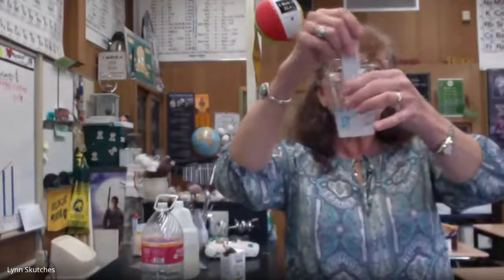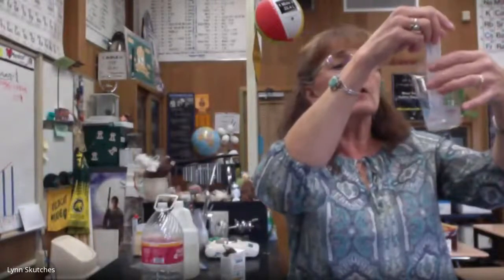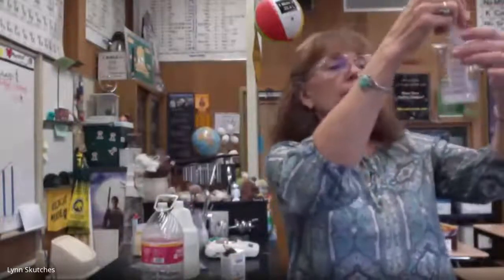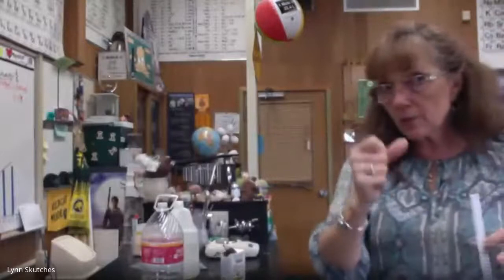Notice what's happening. See what happens to the temperature. Does the temperature change when you put the salt in the water? Okay? And I'm not going to tell you what's happening in mine because I want you to do it yourself. But once you're done with that, you've got to give it a couple minutes. It doesn't happen instantly. These aren't digital.